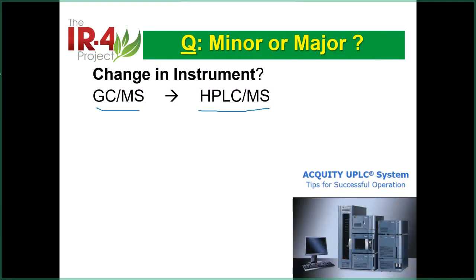Based on the science, the detector, this one or the LC-MS/MS detector, is equivalent or better. Well, it depends on what you think. If you think this is only a tool for separation, this is allowed. You have a different separation, make it better. It's just like a cleanup part.